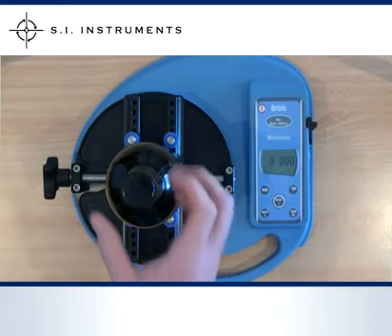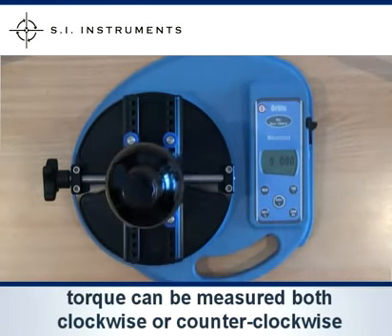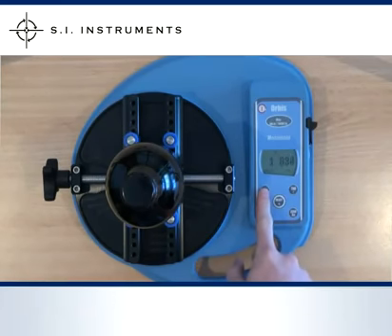Torque can be measured clockwise or counter-clockwise. Pressing the max button will retain the maximum torque in either clockwise or counter-clockwise direction. Pressing the max button repeatedly will cycle through the options.